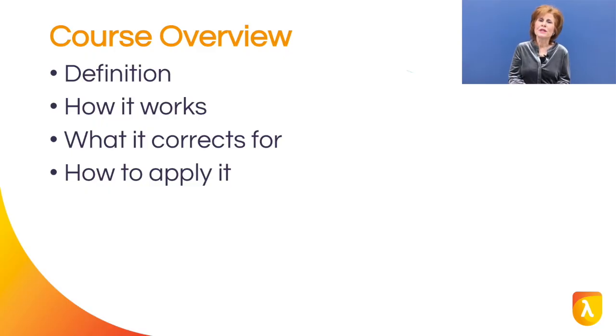In this course, you will learn what normalization is and how it works using 3 different strategies so that you can evaluate and determine the best normalization approach for your experimental conditions and context, as well as what types of variation normalization can correct for. Finally, we will walk you through the mechanics of how to apply normalization to your data sets.